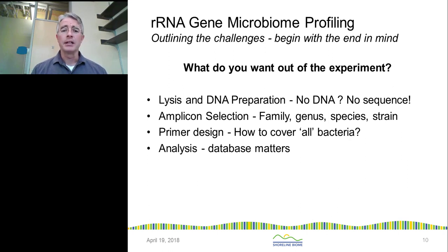And then finally, analysis. You can have the greatest sequence data in the world, but if you're tossing all that up against a database that doesn't contain the organisms that you have, or doesn't have the read length to distinguish them, you're only going to get a result that's as good as your database. So we'll take all of these in turn in the next few minutes.